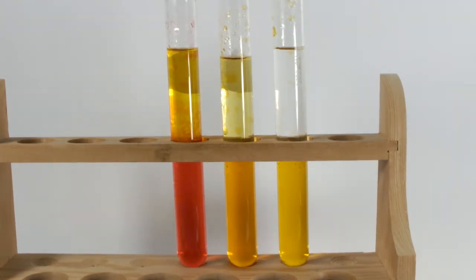So why might all of this be? And why didn't the dye extract in the sodium hydroxide tube? The paper I read for this experiment suggested that there should be dye migration to each of the samples. They were a little more precise about the pH of each test tube, though. They used a buffer. Since I used straight up strong acid and strong base, my results varied a bit more.